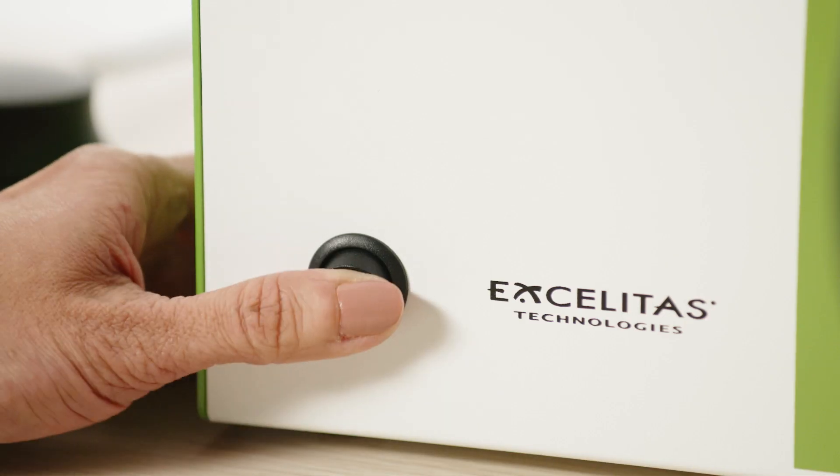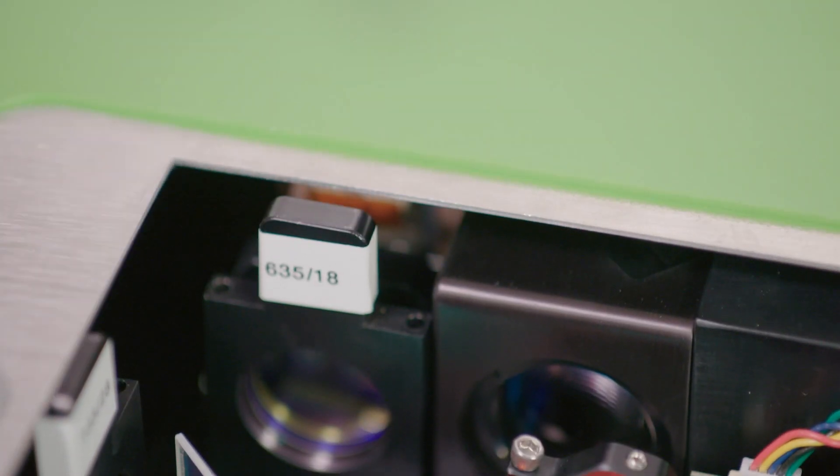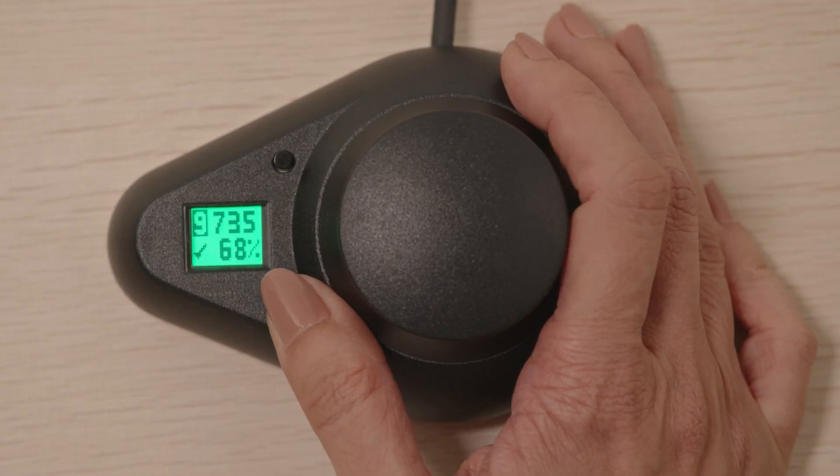All four configurations have quiet operation, pre-installed cleanup filters, and switch times that can keep up with your imaging.